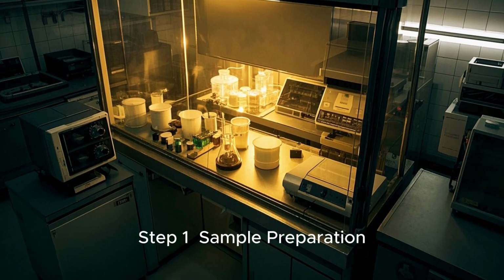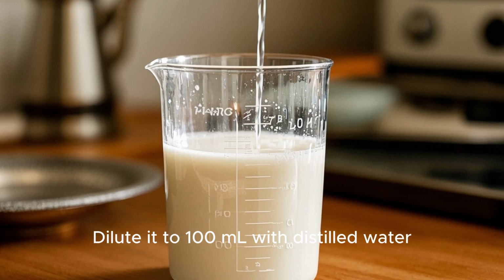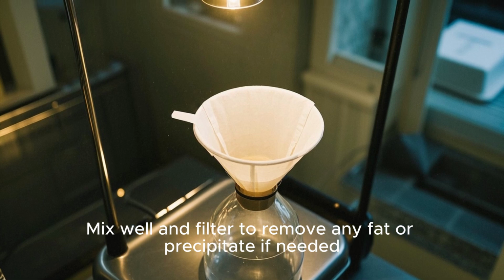Step 1. Sample preparation. Take 10 milliliters of milk. Dilute it to 100 milliliters with distilled water. Mix well and filter to remove any fat or precipitate if needed.